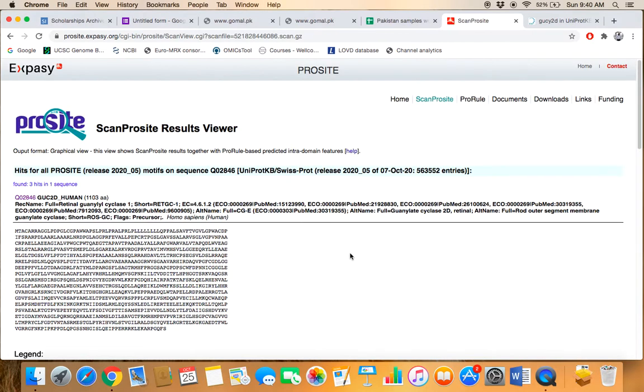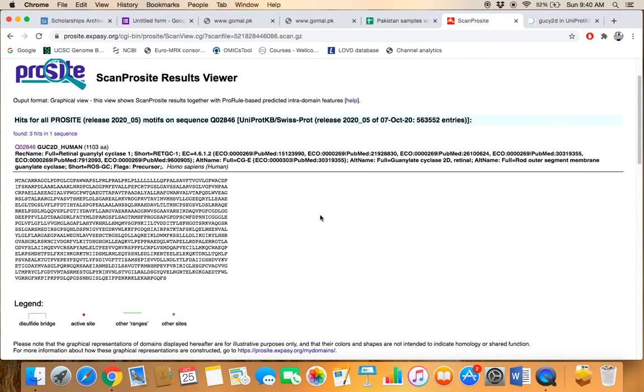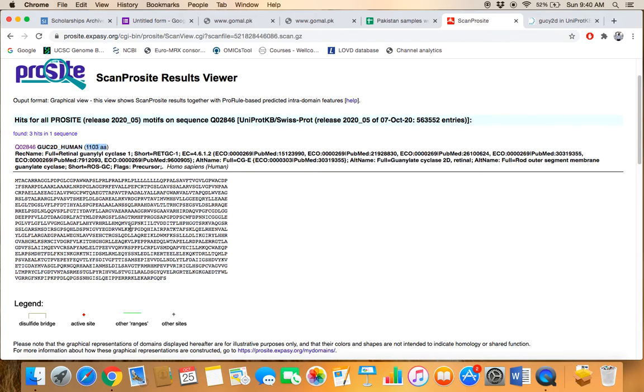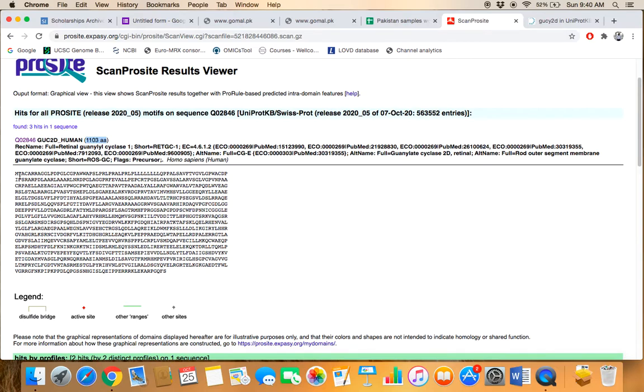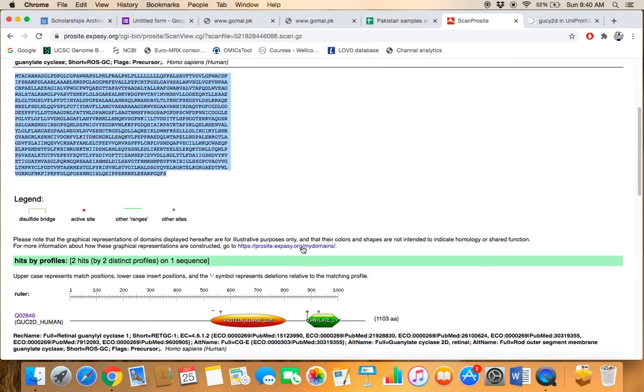So now you are here at the domain page of the GUCY2D protein. Just make sure you have the accession ID that is exactly the same protein that you are looking for. GUCY2D, the length of the protein is 1103 amino acids. Here, this one is the primary sequence of the GUCY2D protein.